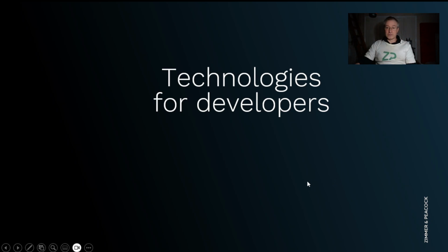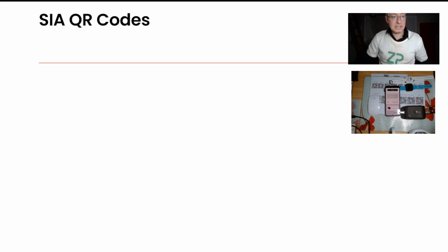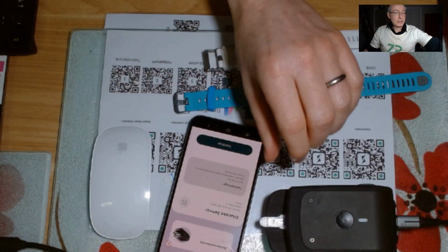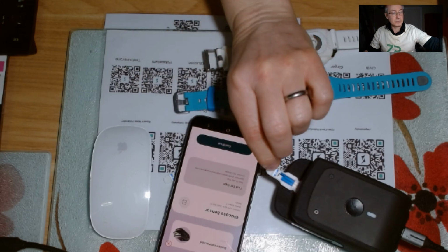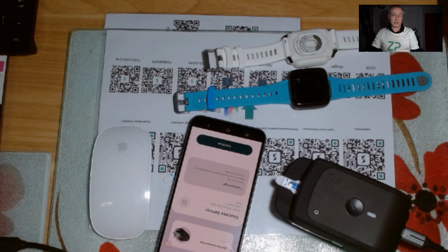So I've got here technologies for developers. I just want to say that I've got the technology in front of me. At ZP, this particular take on the Michaelis Menten kinetics has been from the perspective of electrochemical biosensor development. At ZP, we do a lot of electrochemical biosensor development. We do it on essentially electrodes that look like this. These are screen printed electrodes from ZP. We're functionalizing these electrodes by adding enzymes. There's a black stripe on here, or we also do a circular electrode version.